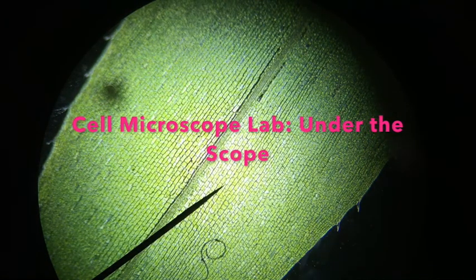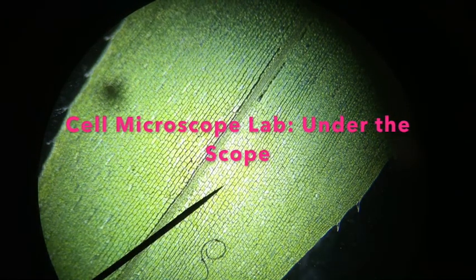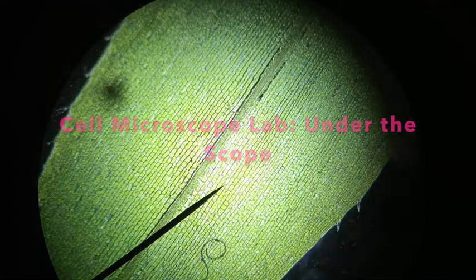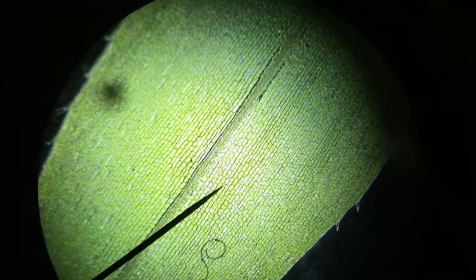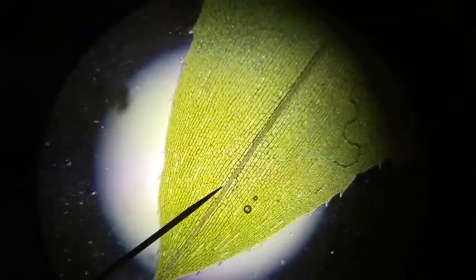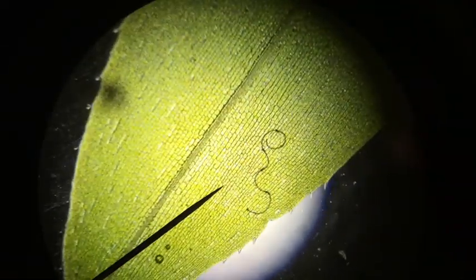Here I have my plant cell under the microscope under low power. I'm going to use the fine adjustment and coarse adjustment to be able to see the various cells. I can see a lot of cells but I can't see a lot of detail. I can move my slide around a little bit to find, maybe near the tip, some cells that are easier to look at.